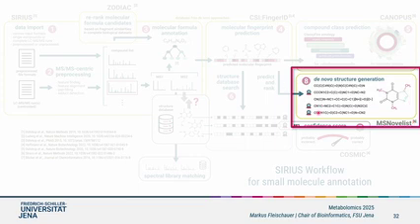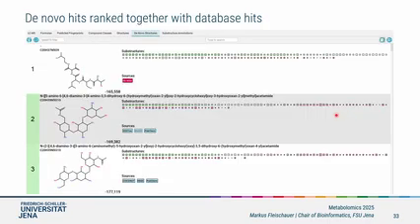And this will basically give you the possibility to, during searching, generate structures that hopefully are a good explanation for your spectrum. And the convenient thing is that they are ranked the same way as all the other stuff is ranked. So even the de novo structures are just part of your one list of explanations. So yeah, you have to look into a different tab for that, but Fleming will show all of this later.